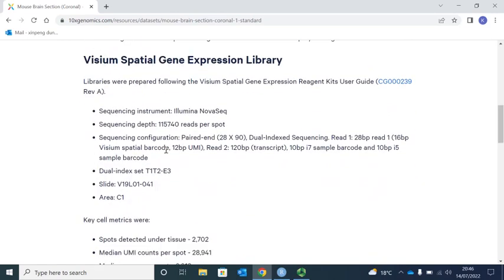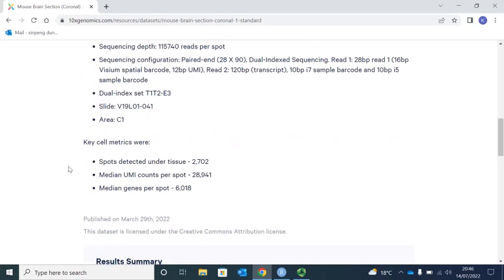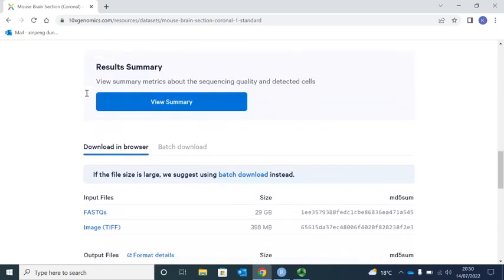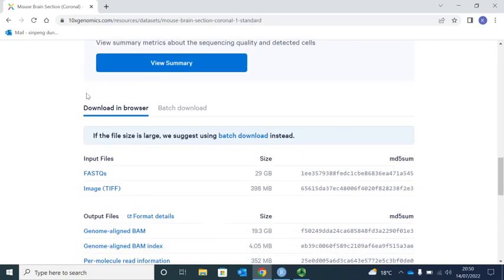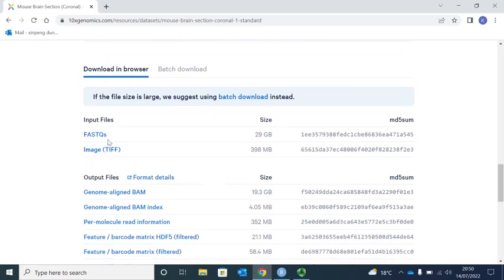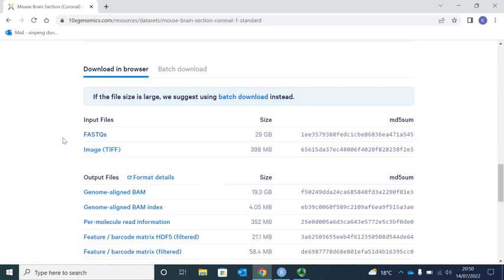Down here is the sequencing information: the machine, barcode, slide, area, how many spots were detected under the tissue, the average UMI counts per spot, and the average genes per spot. Down here are the files we could download to perform spatial RNA sequencing data analysis. Here are the input files — the original FASTQ sequencing data and imaging data.